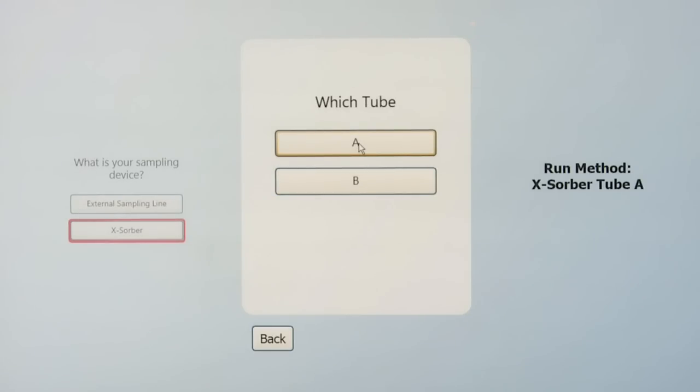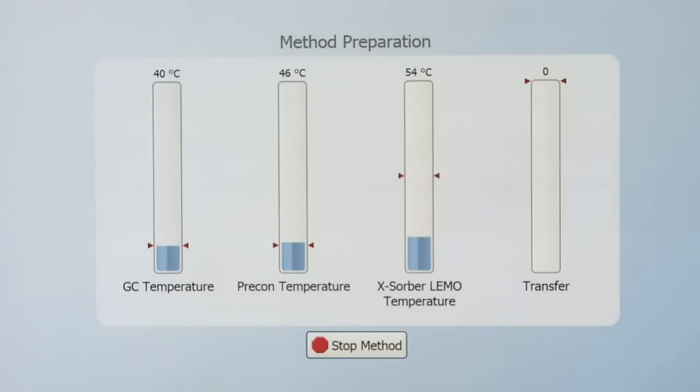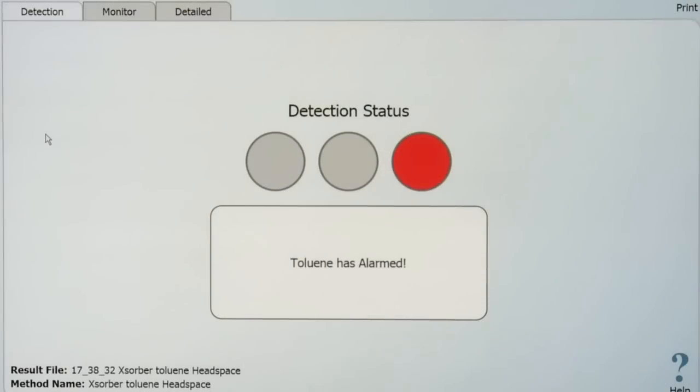Now the system is automatically going to run through a method where it's going to heat and transfer the sample from the Xorber onto the mass spectrometer. It's going to go through the GC separation step and then the mass spec analysis. The method has been in progress.